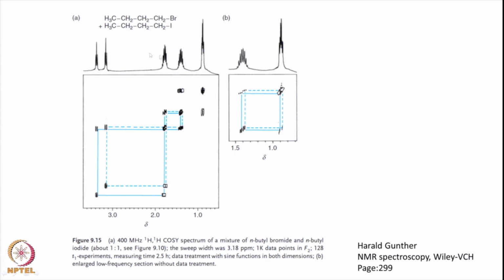The methyl peaks, these are the methyl peaks. The methyl peaks appear here. So on the basis of the chemical shift, the methyl peak spectrum looks like this. So you have here, and obviously the fine structures from the two molecules are not resolved here. Okay. But then how do we know there are two methyl groups here? But look at the correlation here. If I look at the correlation, I see two peaks here. Okay. So these two peaks and the same thing is displayed here. So this is the methyl, this is the blow up.